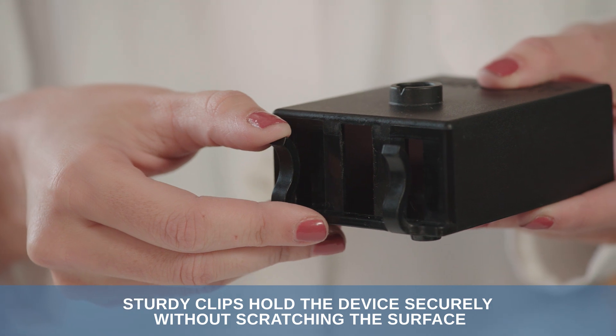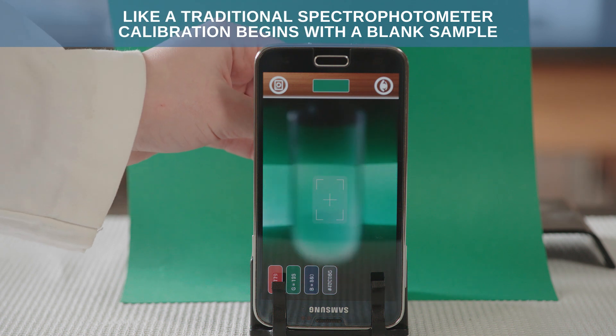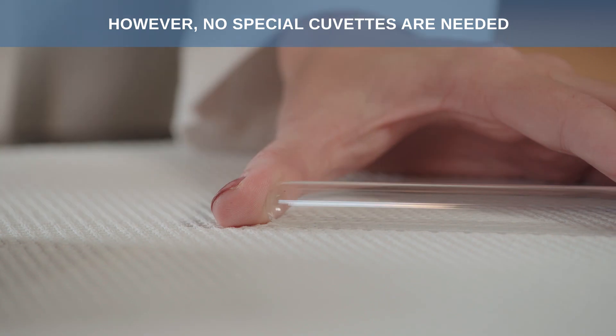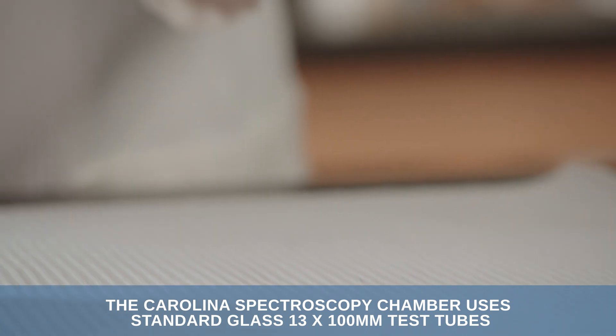Sturdy clips hold the device securely without scratching the surface. Like a traditional spectrophotometer, calibration begins with a blank sample. However, no special cuvettes are needed. The Carolina Spectroscopy Chamber uses standard glass 13 by 100 millimeter test tubes.